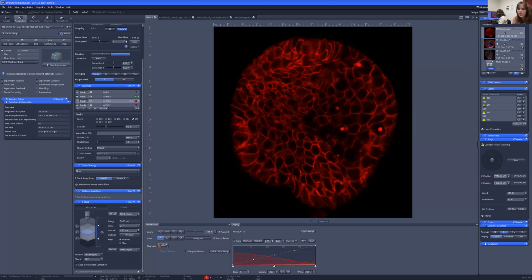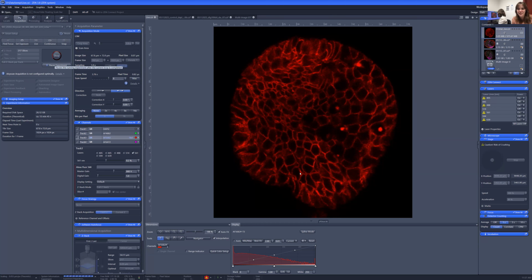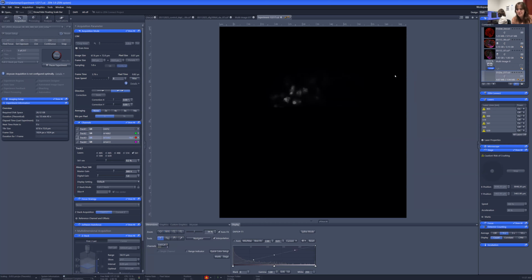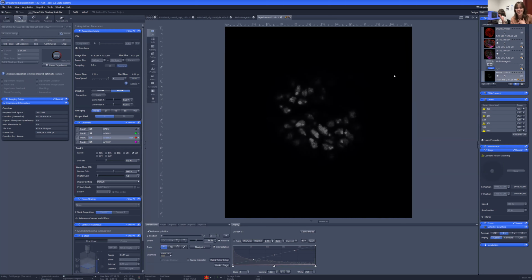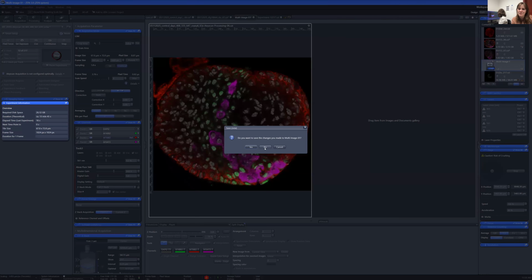Yeah. So we'll come back to that idea of building a 3D model, or at least quantifying these images so you can assign numbers to the cells. Neither of us can explain how computer science works, but Mikala is working with an expert to help do some more of that quantification. Are there any broader questions that people have? I can't answer about Mikala's specific experiment, but I can answer about science in general, or maybe some specifics. I can give it my best shot.